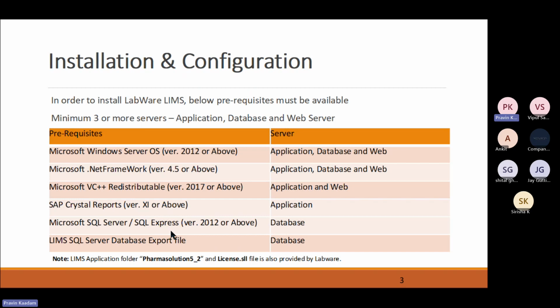SQL Server or SQL Express, again 2012 or above. This is widely used and best supported with LabWare LIMS. Even I prefer SQL Server. I have worked with Oracle, Microsoft Access, and SQL Server, and with MySQL, though not with LabWare LIMS.